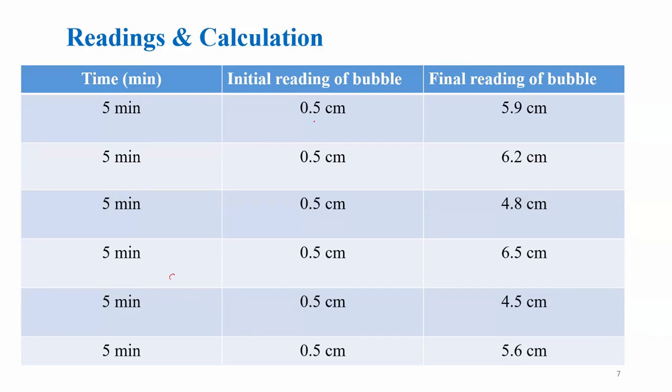Can you calculate? In this practical, we take the reading at 5 minutes interval. Initially 0.5 centimeter. After 5 minutes later, the air bubbles moved to 5.9 centimeter. So from that you can get how far the air bubbles move during these 5 minutes, isn't it? Yes, ma'am.